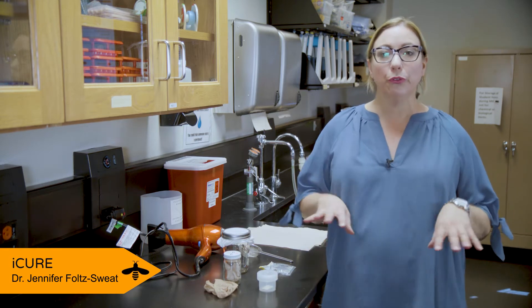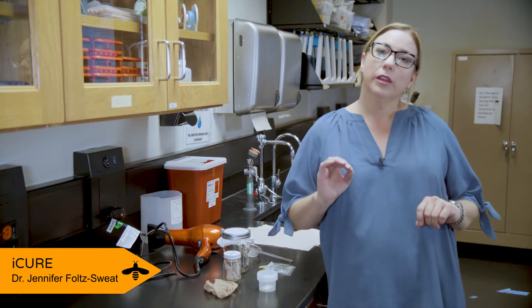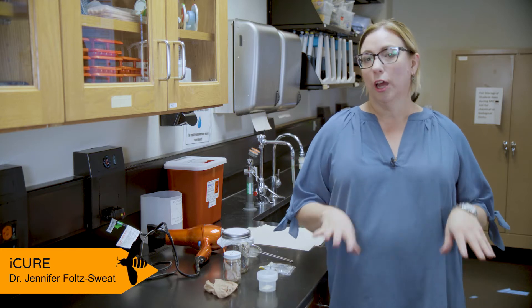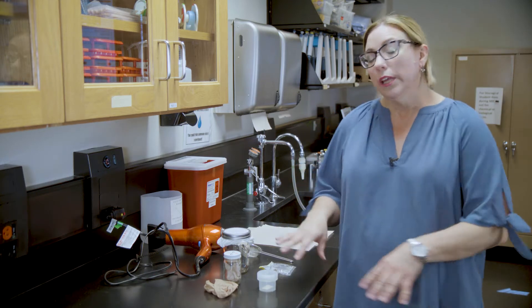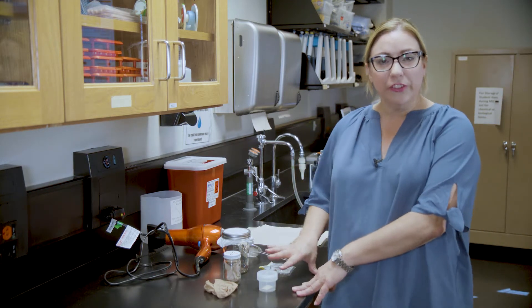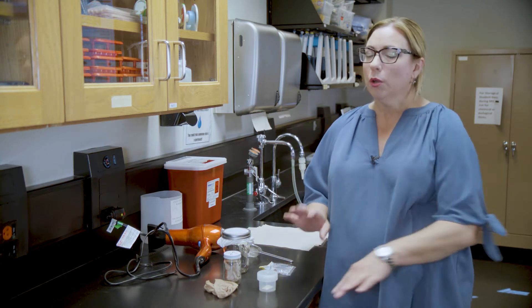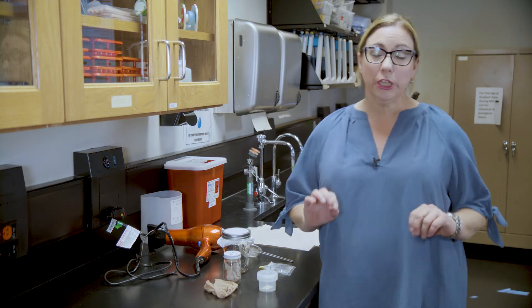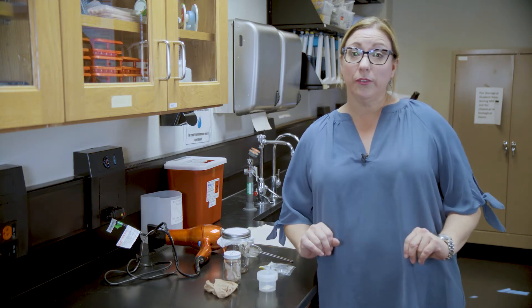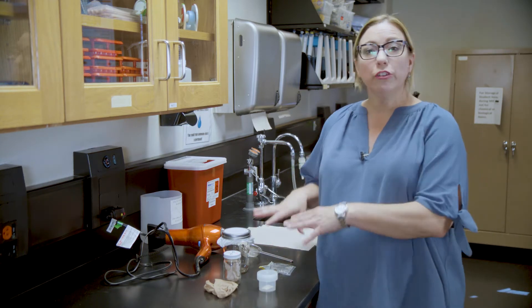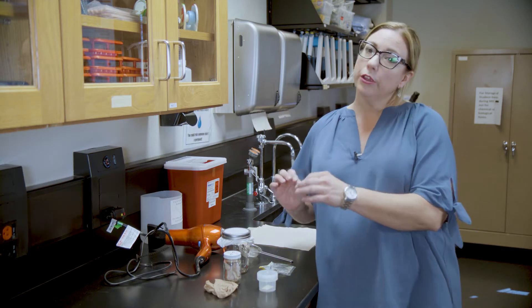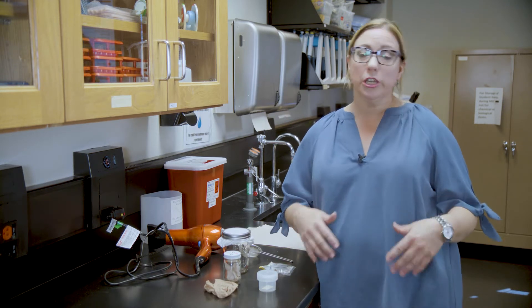I showed you how to do three sampling techniques: netting, pan trapping, and observational sampling. Now I have some bee specimens here that I obtained through netting and pan trapping. Remember, for observational sampling, you will not be collecting any specimens. I'm going to show you how to prepare your specimens for curation or mounting.